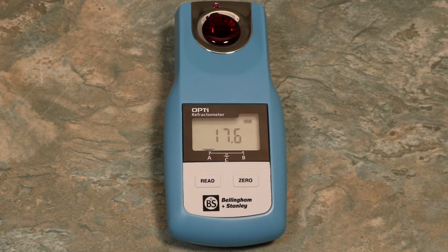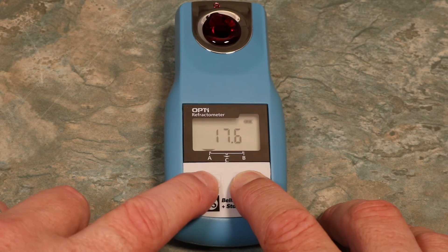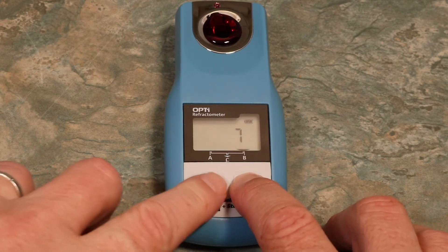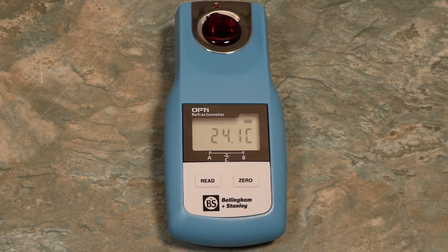To read using a different scale, hold the Zero button for less than three seconds and press Read. Repeat this process to view all available scales. To display the current temperature, press and release the Zero button — this must be done for less than three seconds. Any longer will perform a Zero calibration.